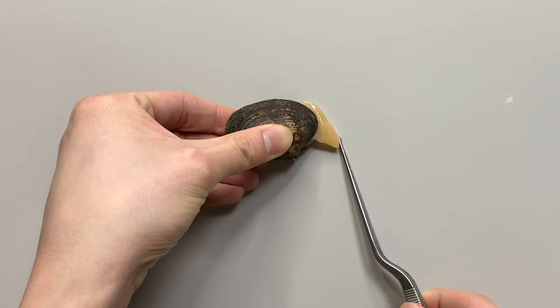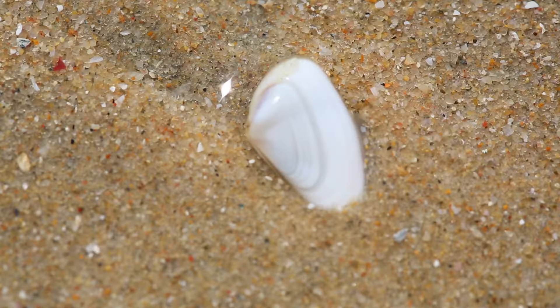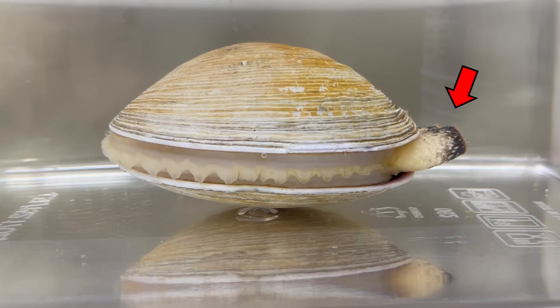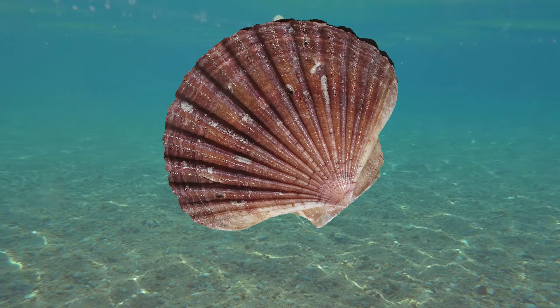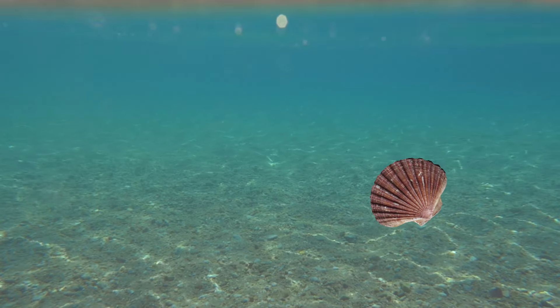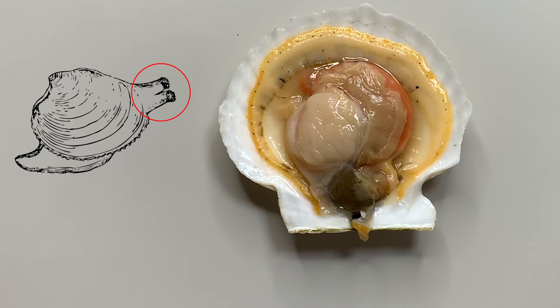This clam lives by burying itself in the soil. Something's sticking out from the shell of a clam — this is the foot of a clam. They use their foot to dig into the soil, and then stick out a straw-like siphon. They create a flow of water through the siphon into the body for breathing and eating. But scallops don't dig themselves into the soil — they just live on the floor. So scallops have a very small foot and also have no siphon.